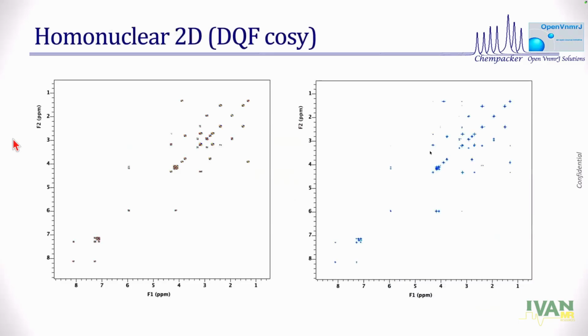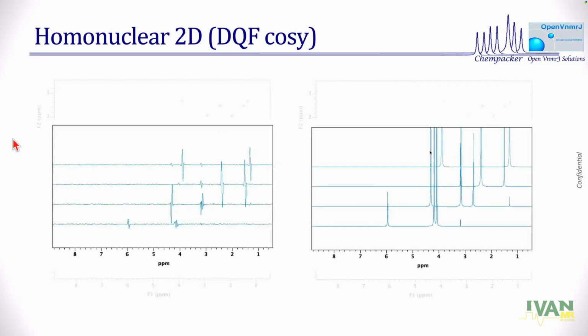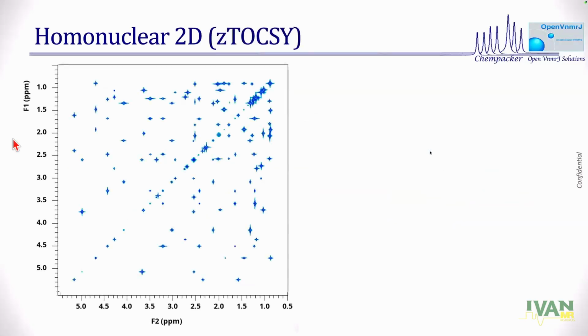Pure shift proton, 2D of COSY. Yeah, sure, why not? That's a 2D double quantum filter COSY. You can apply that. That's perfectly valid. And here are traces. I'm going a little faster because I'm running out of time.